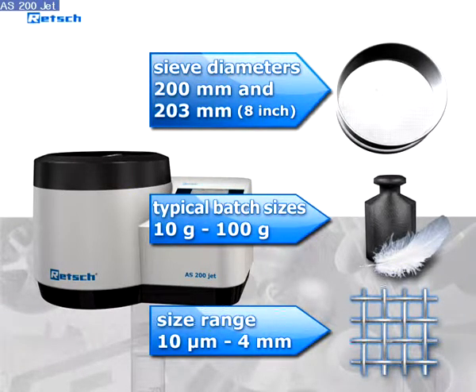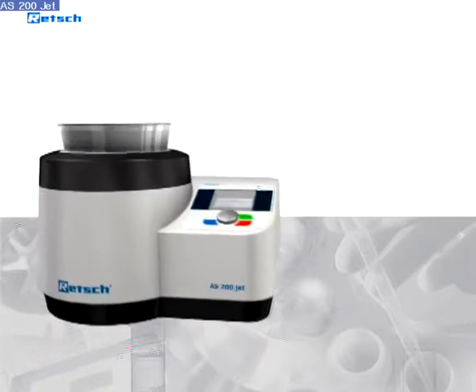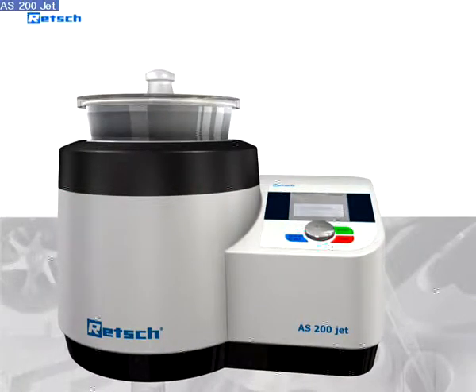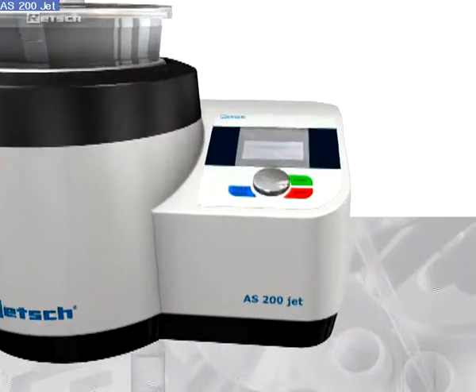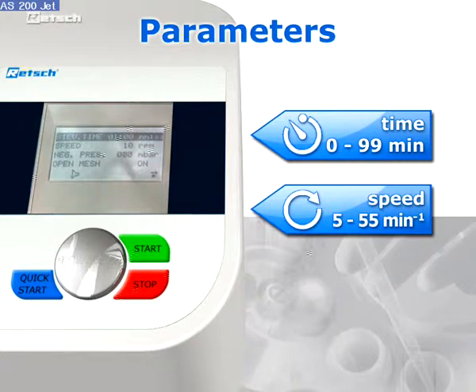Particles in a size range of 10 micrometers to approximately 4 millimeters can be classified. A typical air-jet sieving process begins with the placement of the sieve on the nozzle compartment. The sample is then poured on the sieve mesh and the dust-tight cover is placed on top of the sieve. When the required parameters such as time and revolutions per minute have been entered, the sieving process can be started.